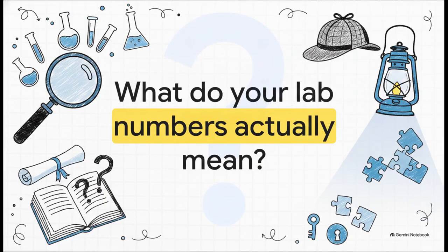Okay, let's dive into this. When you get an ICP test result, it is so tempting to look at it as an absolute answer key. You see a number, you assume that's the exact reality of your sample. Boom, done. But what if I told you that a lab report isn't an answer key at all? Actually, scratch that. It's more like a mystery case file. It's a collection of clues that desperately needs decoding.